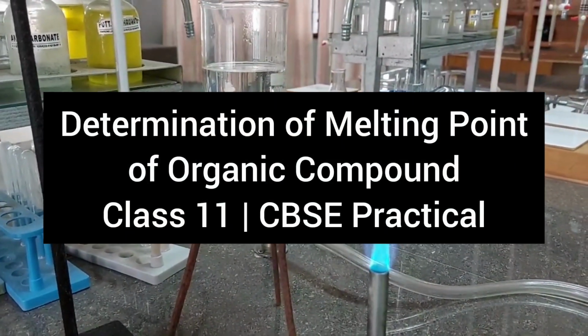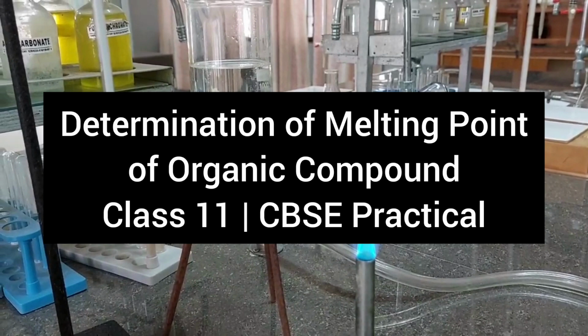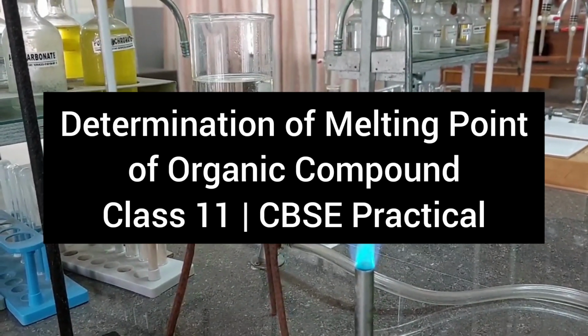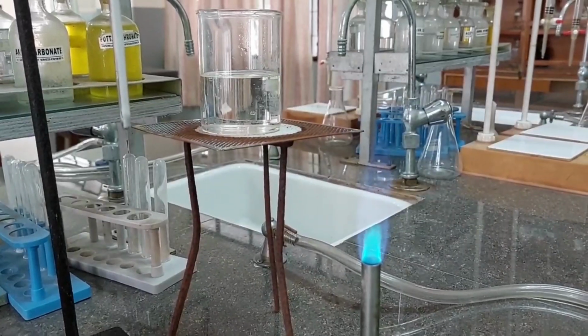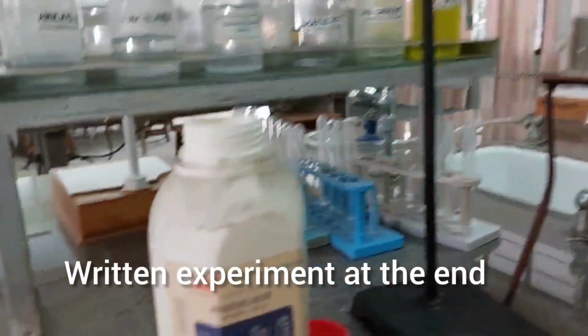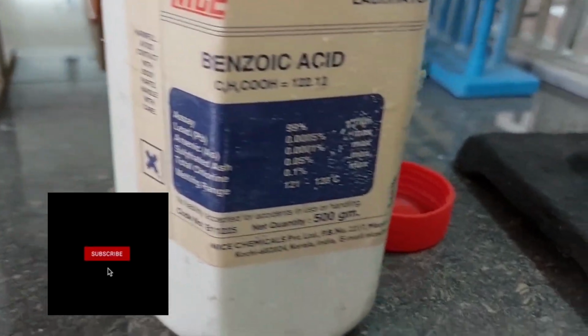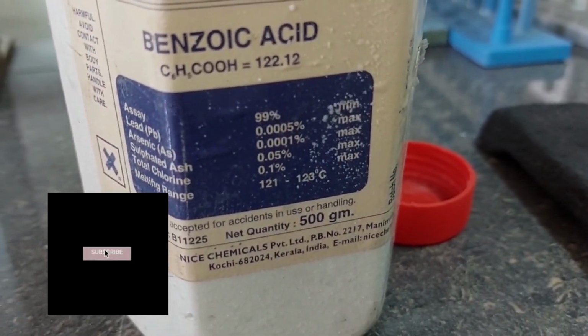I am going to discuss today with you determination of melting point of an organic compound as a requirement of class 11th CBSE practical series. So we are going to today determine melting point of benzoic acid. The melting point is approximately 121 to 123 degrees C.